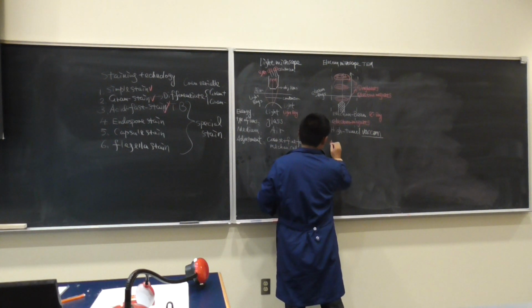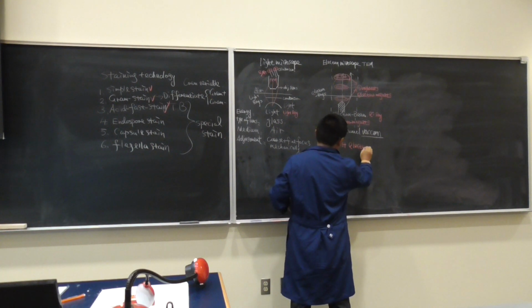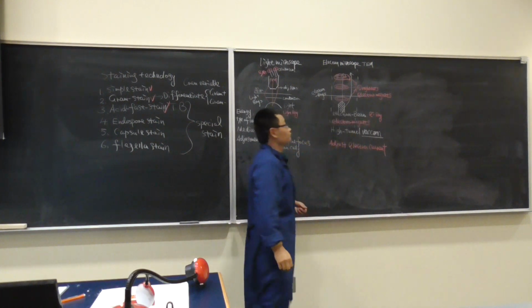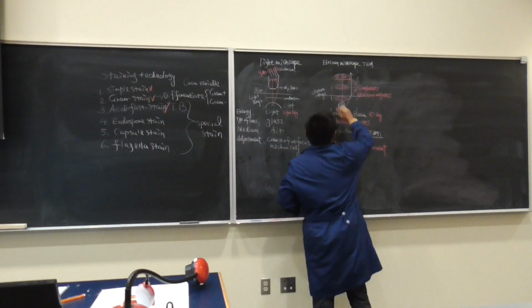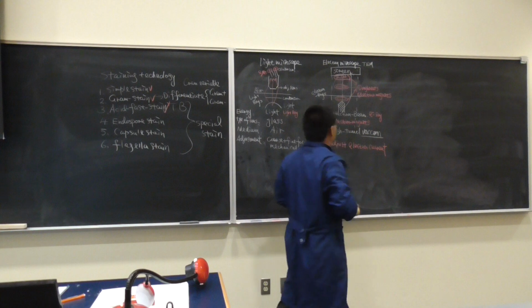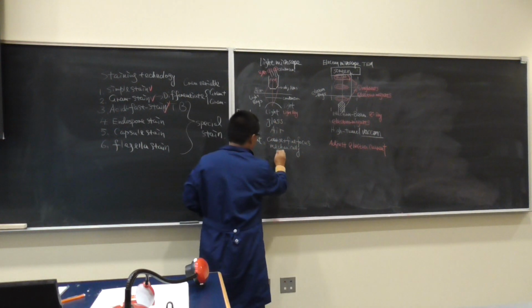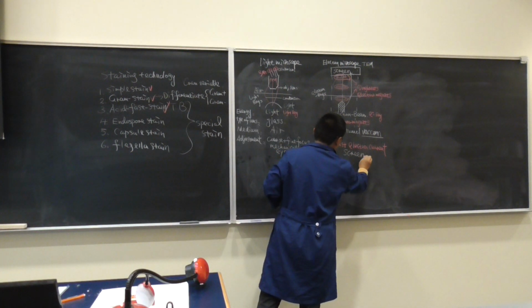You have to adjust the electron current. You adjust the electron current, and the image will change. So at the end of the day, instead of using an eye to see it, on the top you will see a screen. Everything shows up on the screen. That is important. Okay. This is you using the eye to do the observation. This is it showing up on a screen.